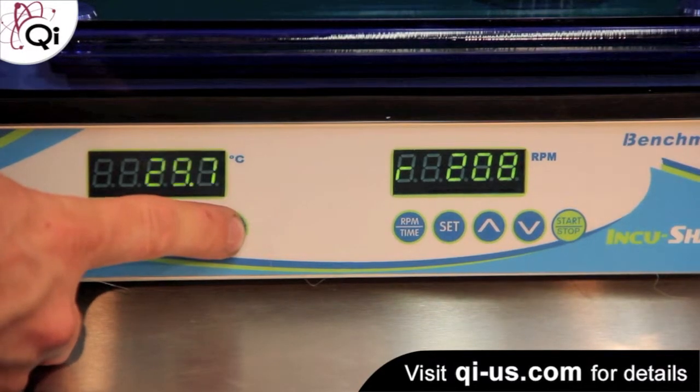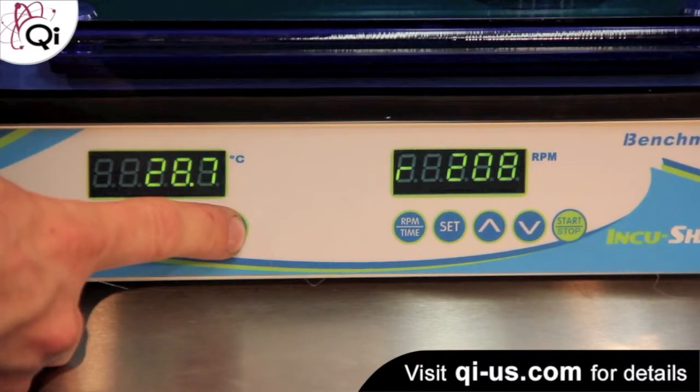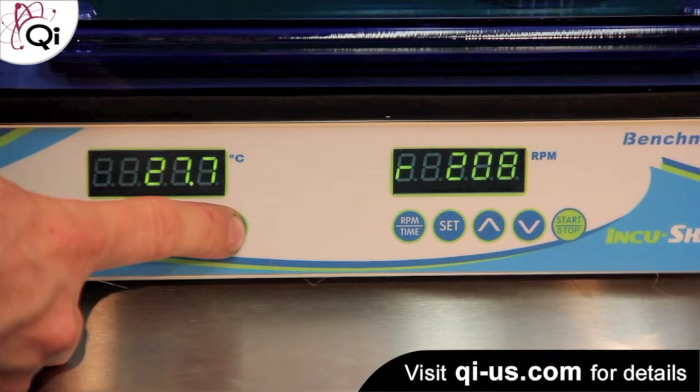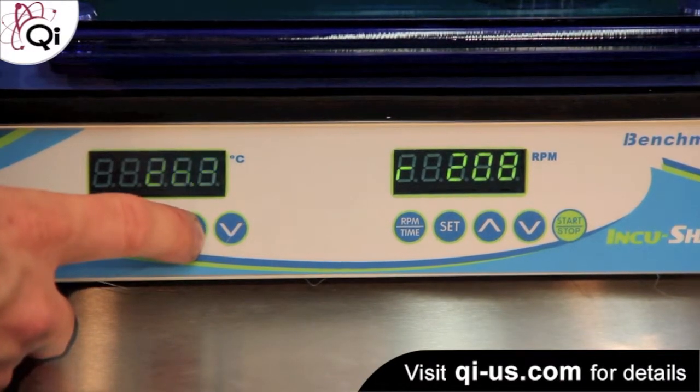Operation of the Incushaker is very simple as well. You can quickly change the temperature within the controlled environment.